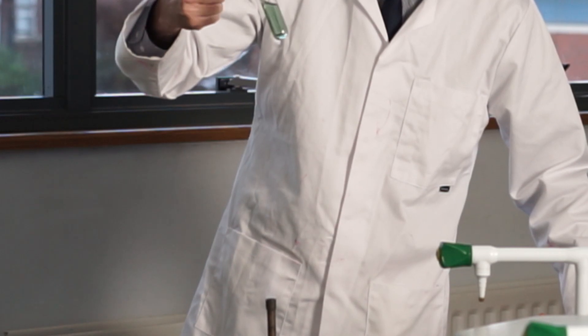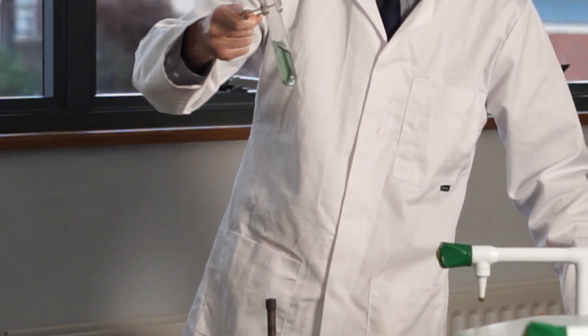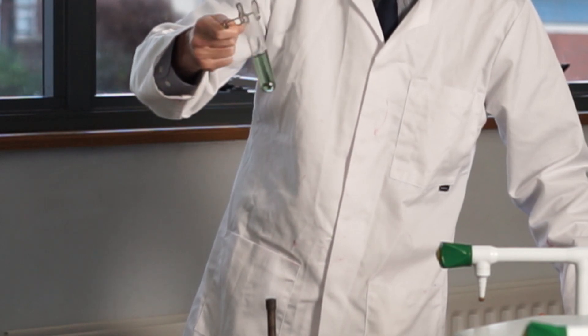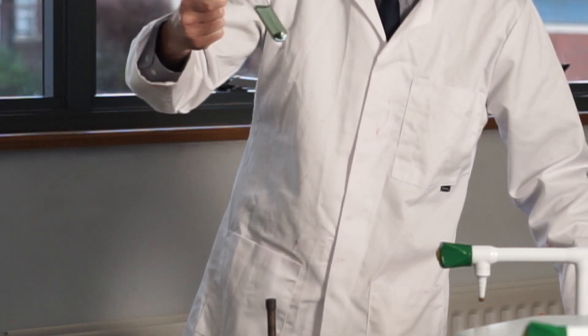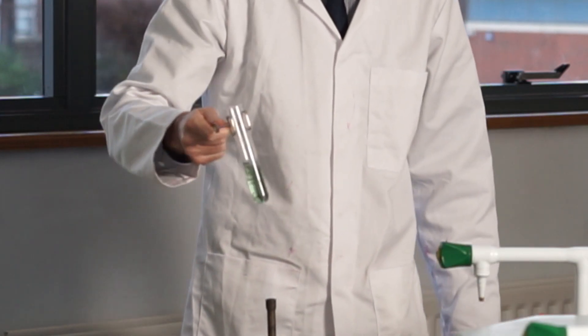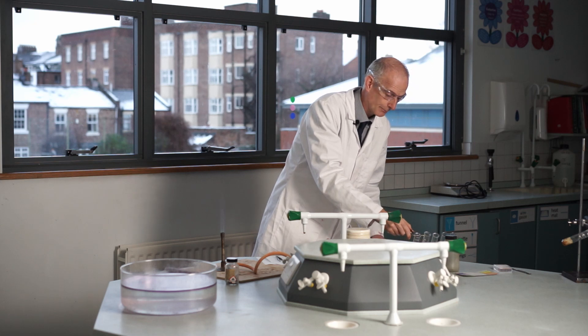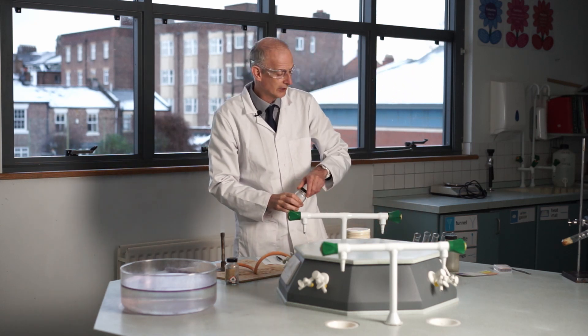I'm going to leave that and come back to it in a bit, but I think it's got a darker colour — heading more towards the blue end rather than the yellow end of green. We've given it a bit of heat and we'll come back to that. Now we're going to go on to iron.